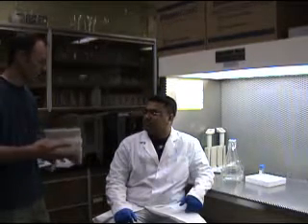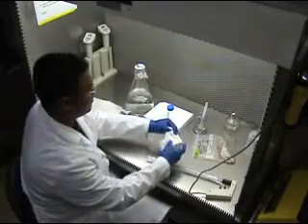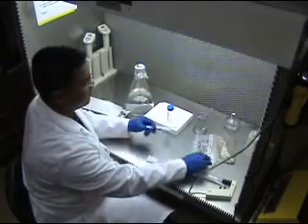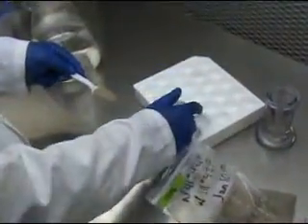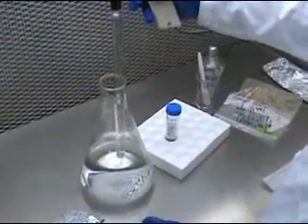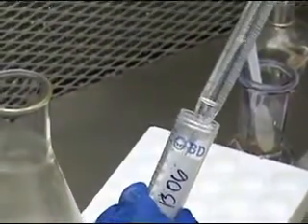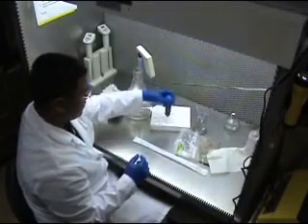Janita is going to first sterilize the scoop he uses to work with the soil, so that he doesn't cross-contaminate samples. He does that using alcohol and sterile wipes. Then he's going to add about 5 to 10 grams of soil into a 50 milliliter centrifuge tube, which he'll then fill to 50 milliliters with autoclaved water using a pipette. When he puts the dirt in, he tries to avoid large rocks. Then he's going to shake it and let it sit for a little while.